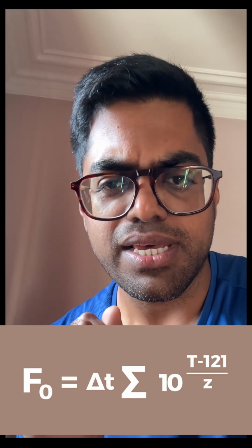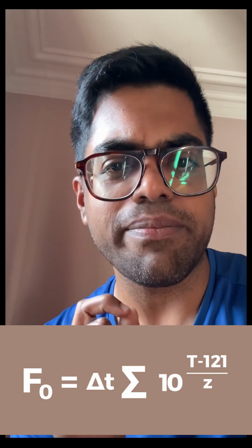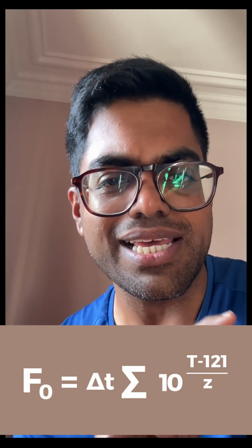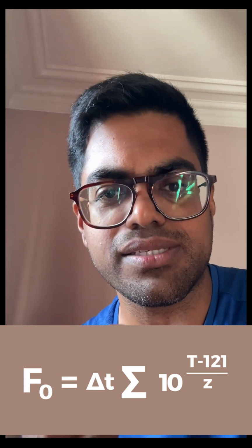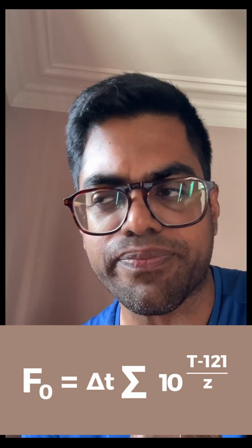F0 is the accumulated lethality over time with the reference temperature of 121 degrees when your Z value is 10. So it is the equivalent tool actually. As I mentioned, your temperature may not be 121 when you set it as a reference; it could vary. So it makes equivalence. It is just like a gold standard, right? When you have a different combination of time and temperature, you can easily make it equivalent to your reference temperature in F0. It is easy to understand how much F0 you are getting as a process because it is the equivalent of 121.1.